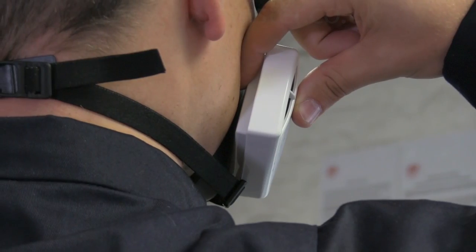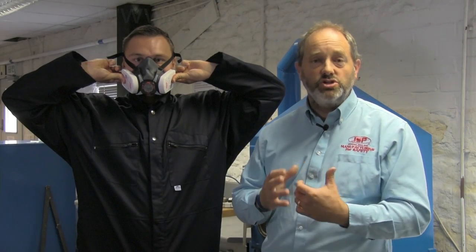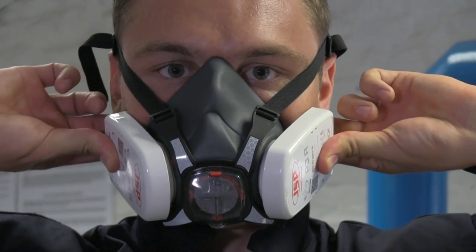Now to check the mask fits okay, what we're going to do is do the press to check. So Joe will seal the filters and breathe in, and we can see there we've got distortion of the mask as it sucks into the face.